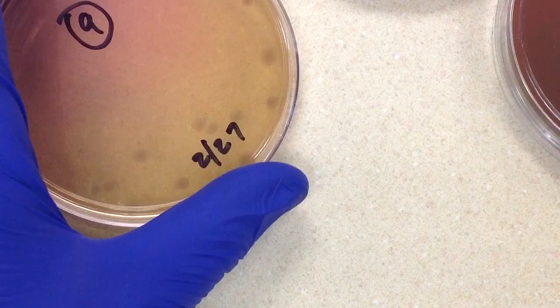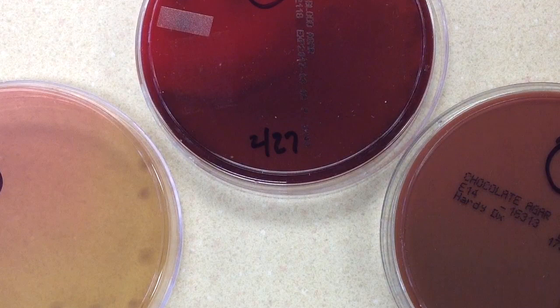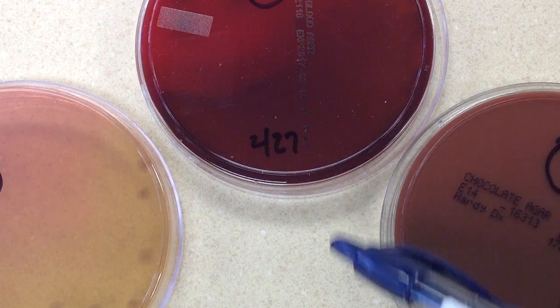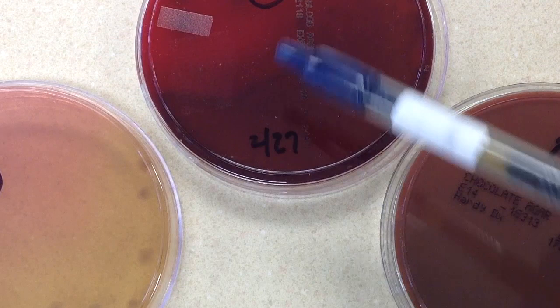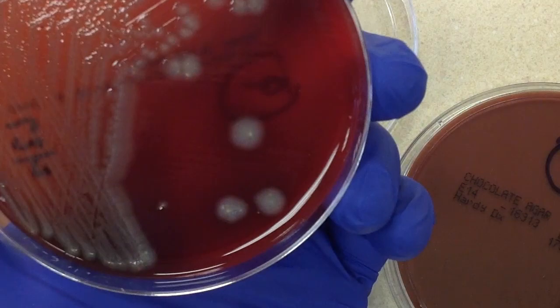The workup here is pretty straightforward — we have one colony type, a gram negative rod growing on MacConkey. The first test we always do in this situation is an oxidase test. The oxidase test is color-based, so we would never perform it off the MacConkey plate, because pink colonies could interfere with the color of the test result. We'll do it off the sheep blood or chocolate plate.